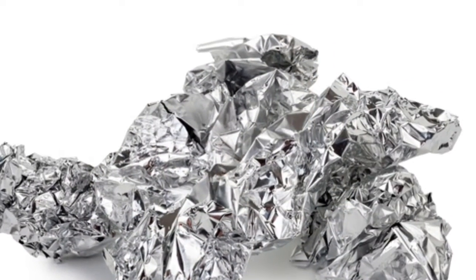Alright, so how did we grow the alum crystal? First of all, we dissolved some scrap aluminum foil in 9 molar KOH, potassium hydroxide. We made sure to break up the foil, as more surface area would allow the reaction to proceed more quickly. Potassium hydroxide reacted with the aluminum, creating bubbles and intense heat. My lab partner and I waited until the reaction had ceased before moving on, and we knew that when no more hydrogen gas was emitting from the beaker.